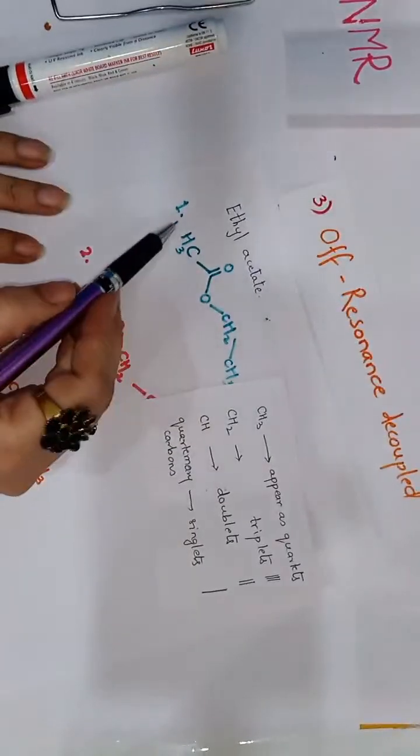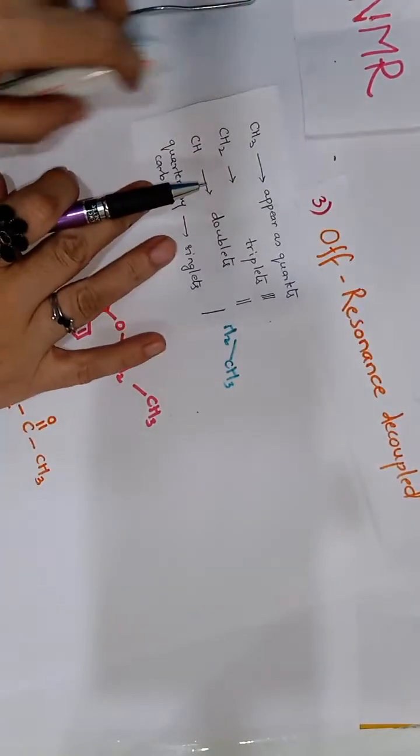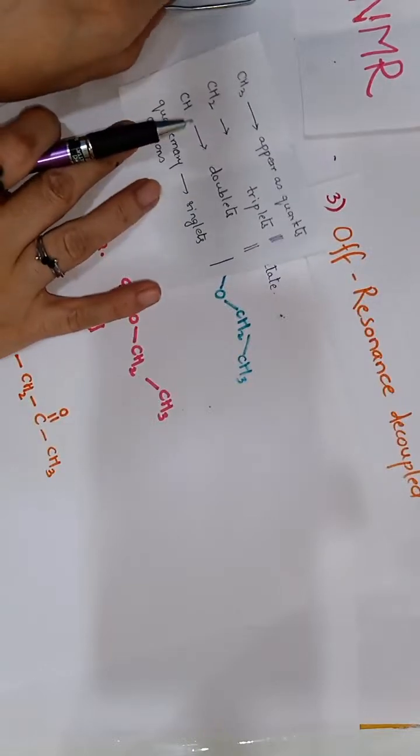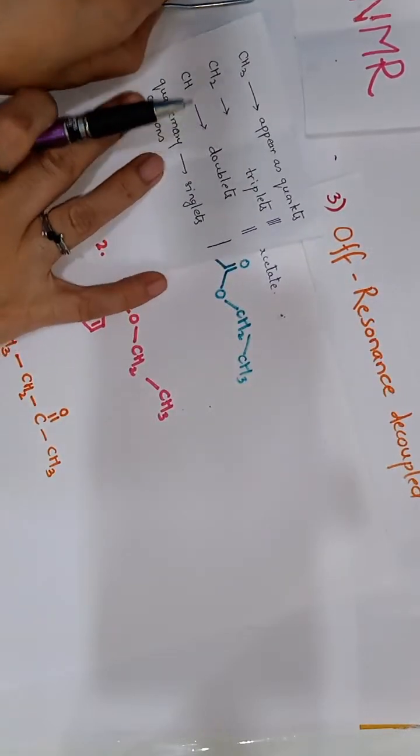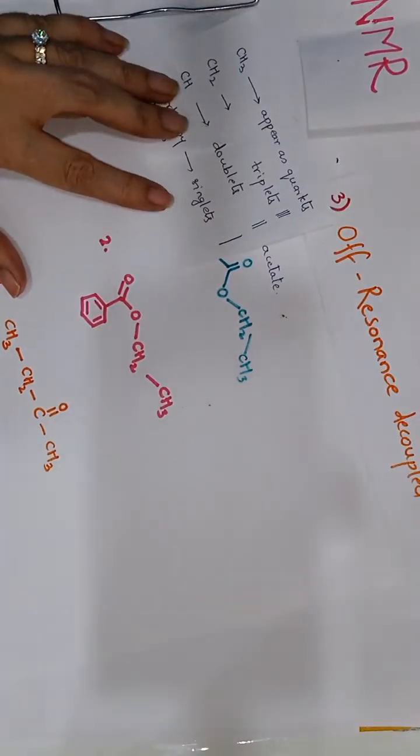So we have a CH3 here. It will appear as a quartet.